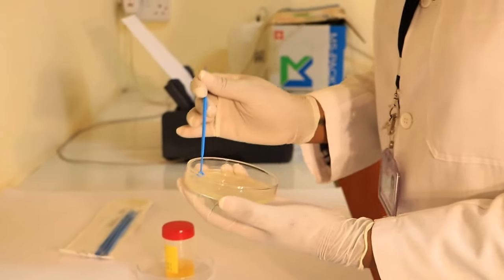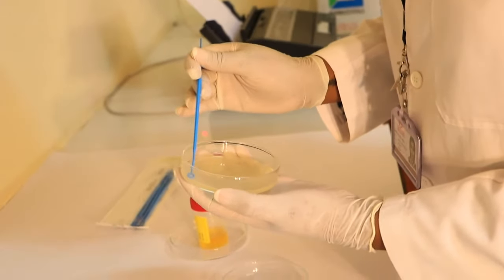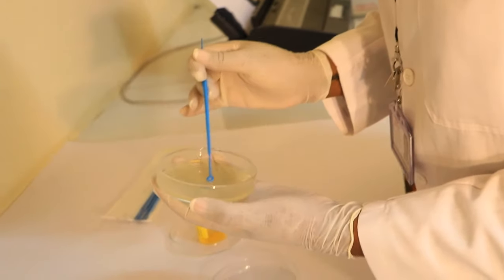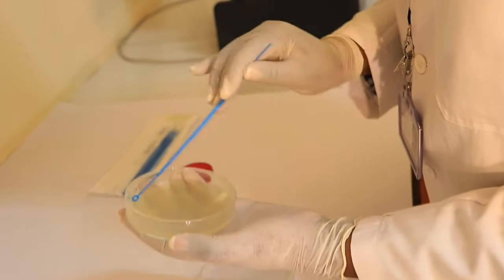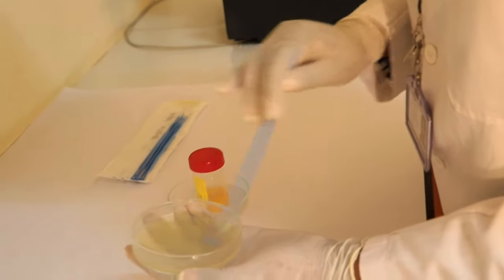Streak the urine down the middle of the plate and then streak from side to side to distribute the organisms evenly on the plate.